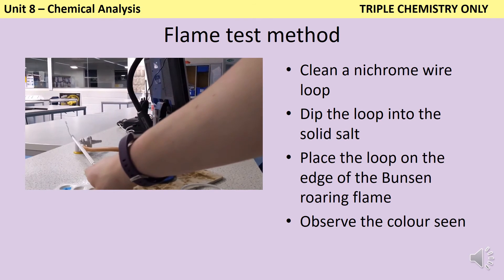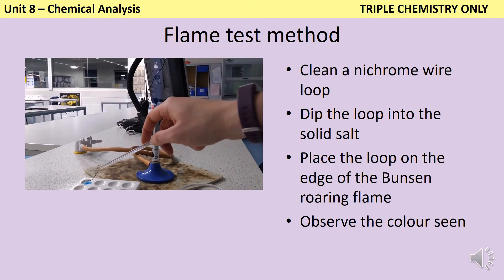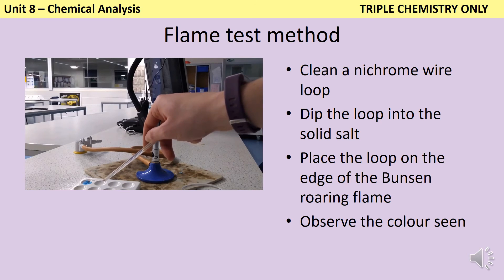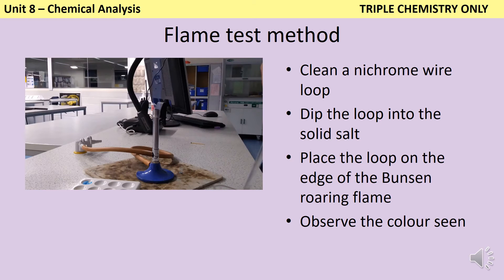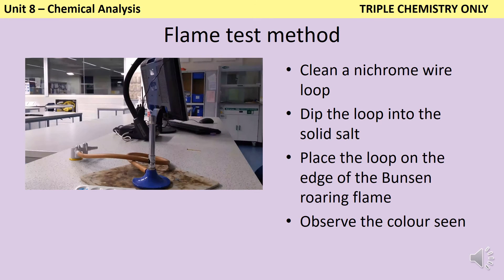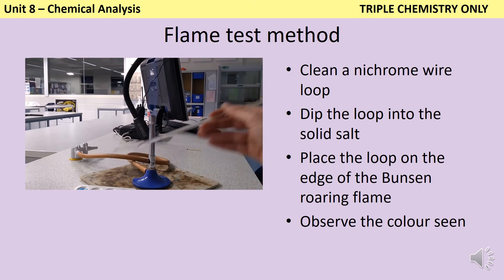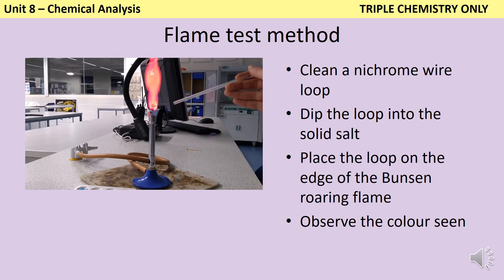Here I've got a small amount of copper compound — you can see it there in my spotting tile. I put the wet wire into that copper sulphate, then put it into the edge of the clear part of a Bunsen burner roaring flame, and you can see that greeny blue flame there. Before I can do another test, I need to return it to the hydrochloric acid to remove all of the leftover copper compound. Now that the wire is clean, I repeat the same test using a lithium compound, and again I see that crimson dark pinky red flame.